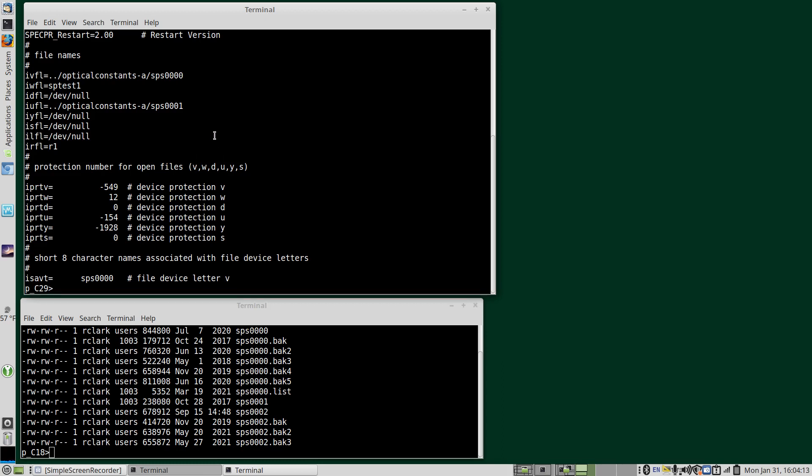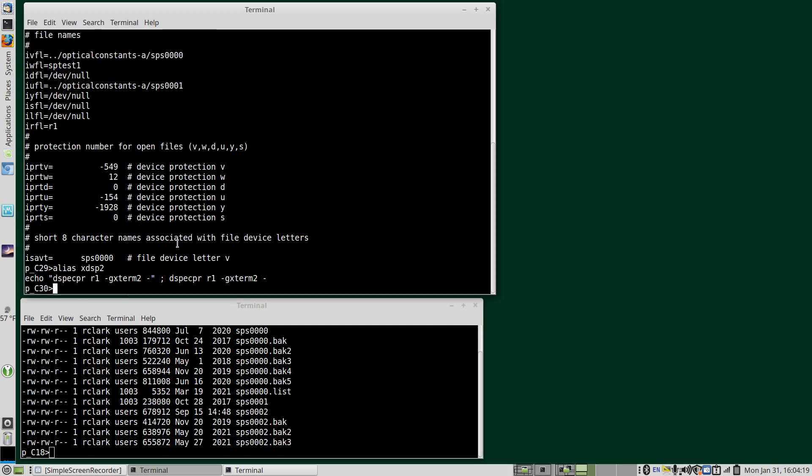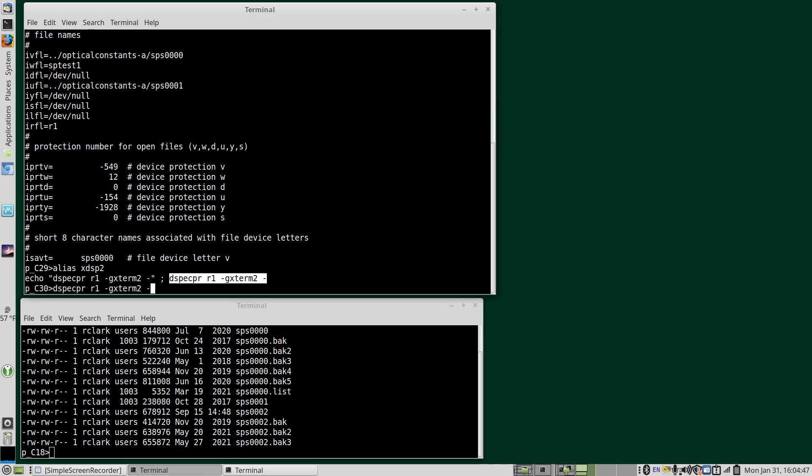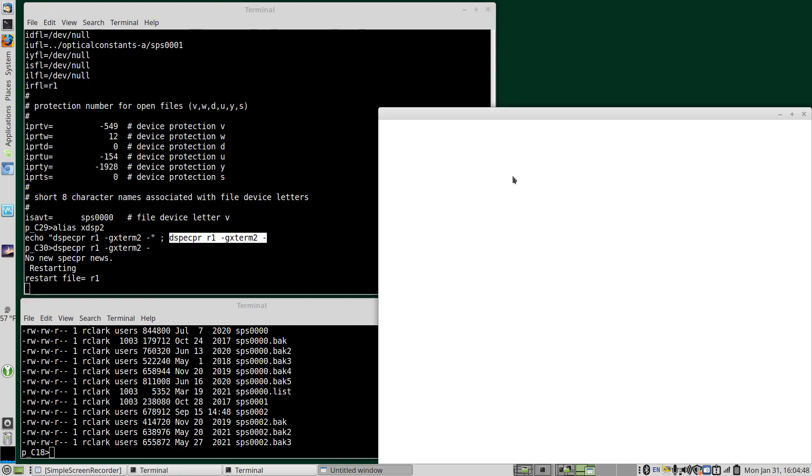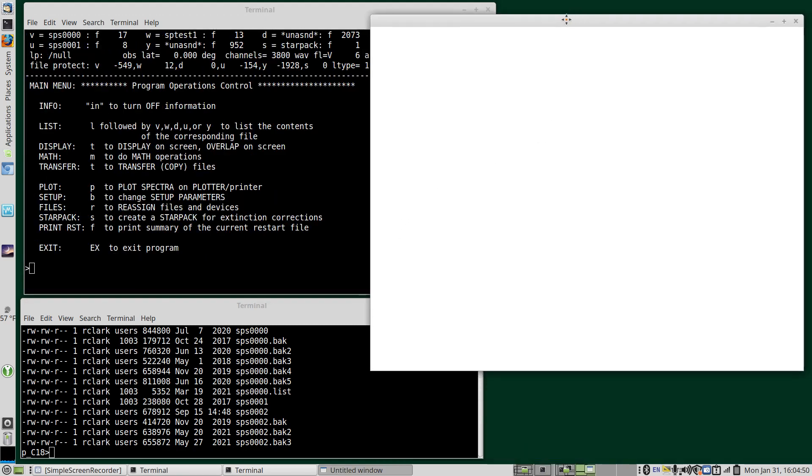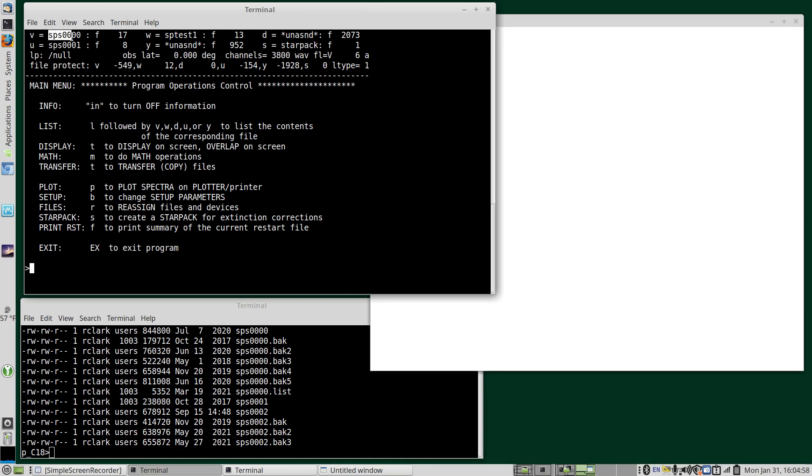If we needed to start SPECPR, I always use an alias, run SPECPR. And DSPECPR is the latest developmental that has all the newest features. At the moment, most of the time, like on PSI's pan spectroscopy computer, DSPECPR and SPECPR are the same. The XTERM2 is a double size from the default and it makes a pretty large window for viewing spectra. So you can see we have the SPS0000 file and the 01 file assigned and our test assigned. So we don't need to do anything else in terms of setup.